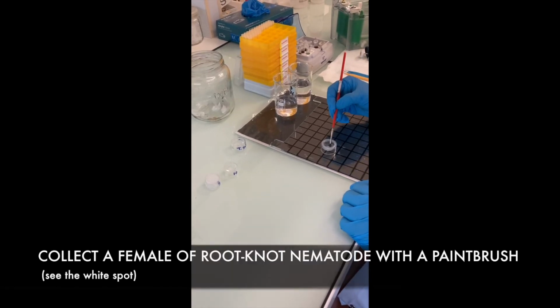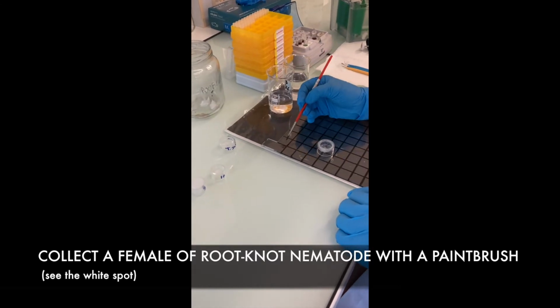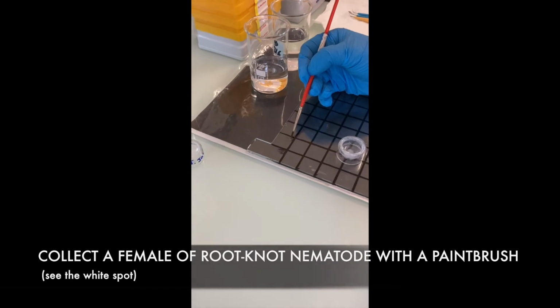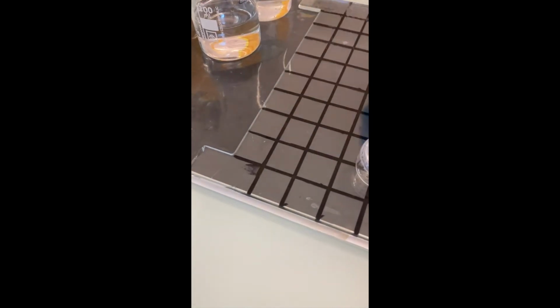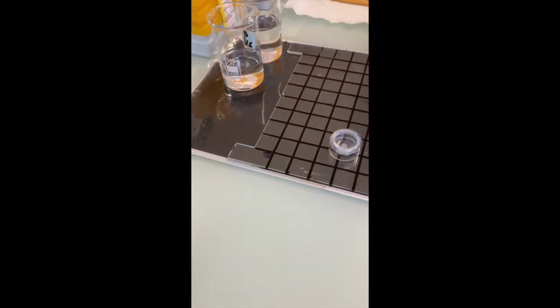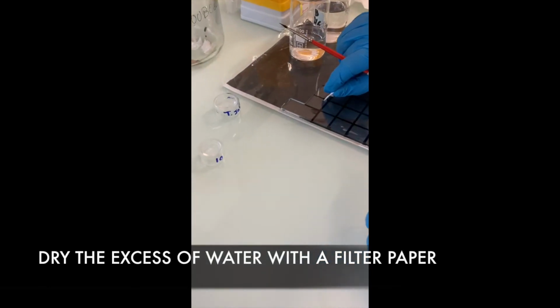Collect females previously isolated in samples using a small paintbrush. You can directly distinguish the female nematode. Here, the white spot. Dry excess water with filter paper.